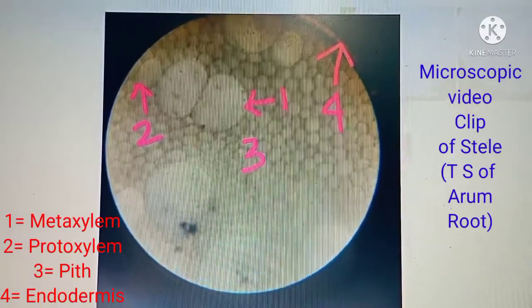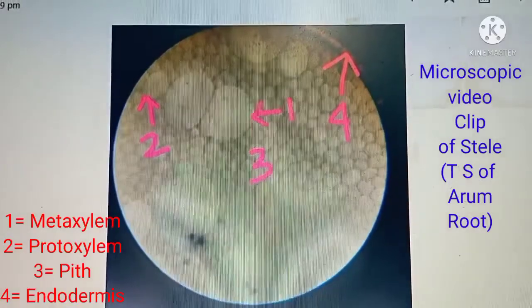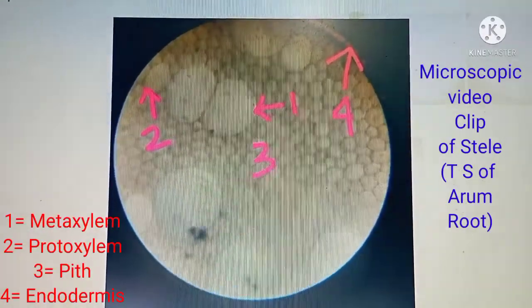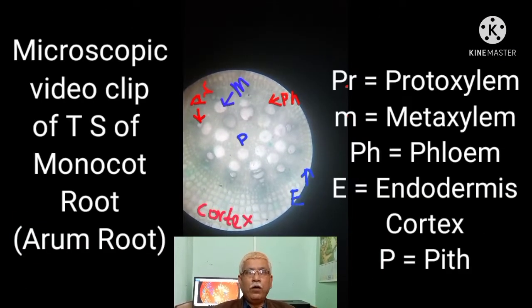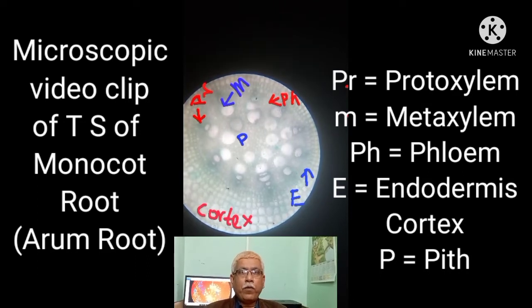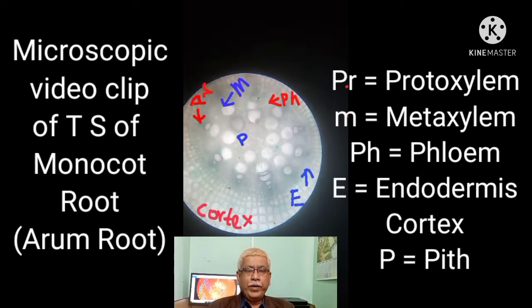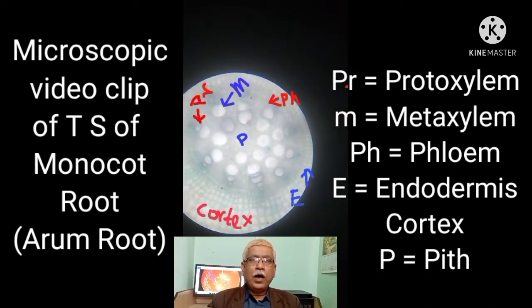In the microscopic image of the stele: metaxylem is identified as one, protoxylem as two, pith as three, and endodermis as four. This is a video clip of a TS of Arum root taken from a microscope under low power. Cortex and stele are well differentiated; components of stele such as metaxylem, protoxylem, phloem, and endodermis are clearly visible as identifying features.